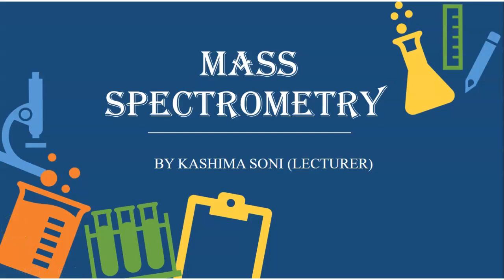This is Kashima Soni and today we are going to take up the next part of our series on mass spectrometry, that includes another two most important mass analyzer techniques: the quadrupole mass analyzer and the time of flight mass analyzer.